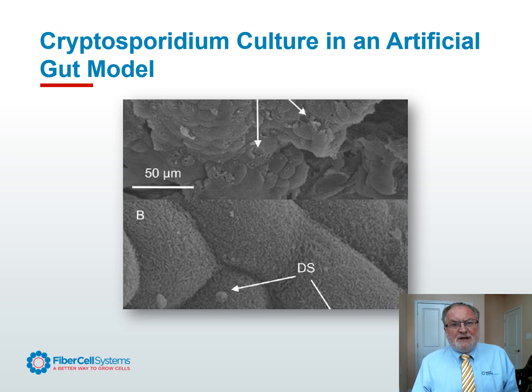This is something I'm particularly proud to have participated in. Cryptosporidium is a single-celled parasite that infects the lower bowel of 40% of the children in Africa. It's a very complex disease with no known treatment. Until recently, it's not been possible to culture it in the laboratory in vitro. A couple of groups at Pace University and Tufts University Veterinary Medical School developed a way to culture Cryptosporidium in the hollow fiber bioreactor cartridge.